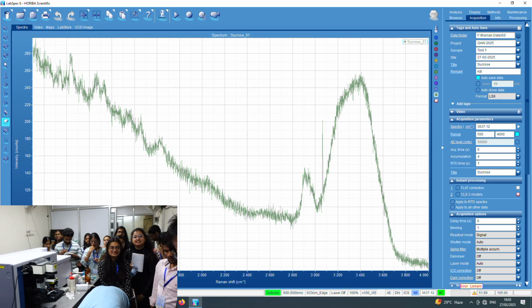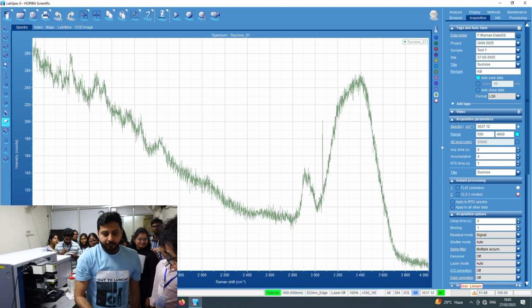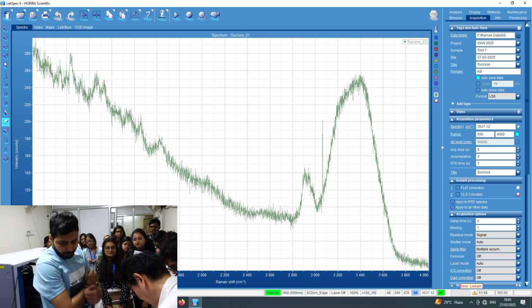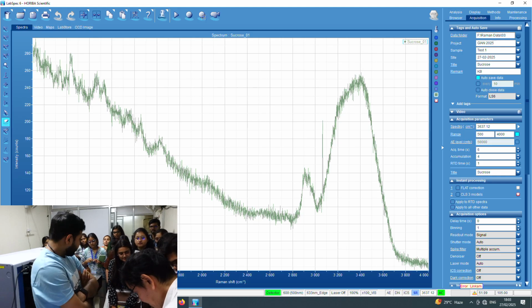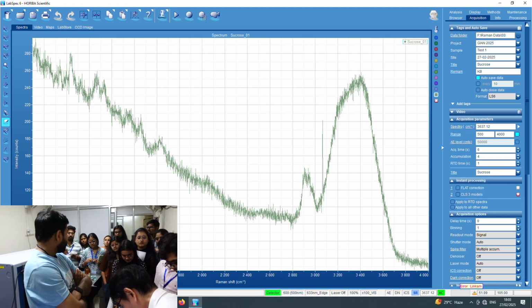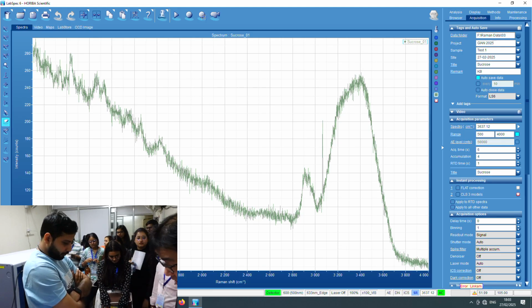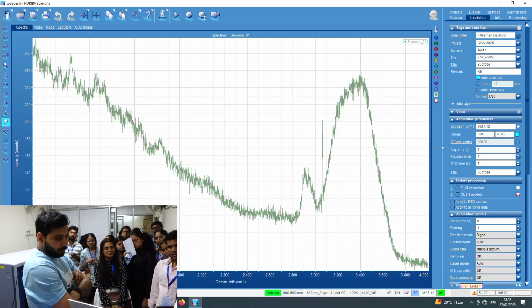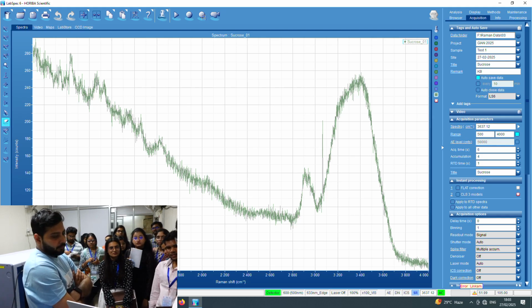Okay, at a glance, we find the new peaks in the measurement of the sucrose in water solution, right? So like we did yesterday, let's do the data analysis. This is text data. Yeah, text.